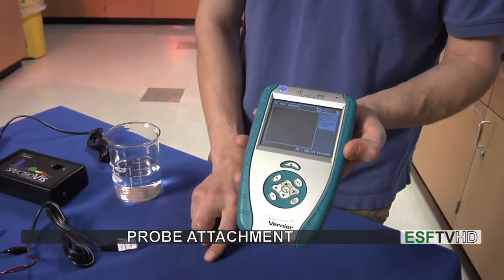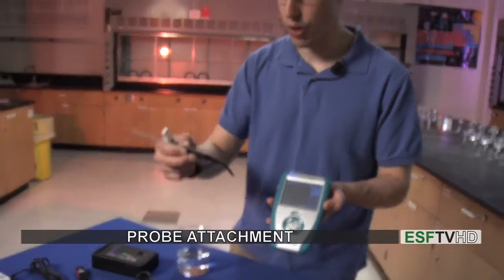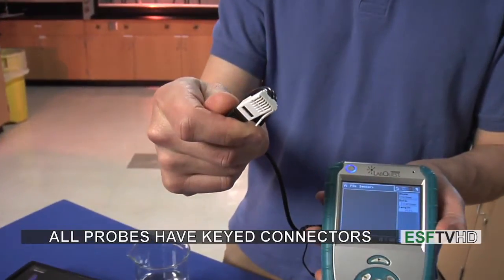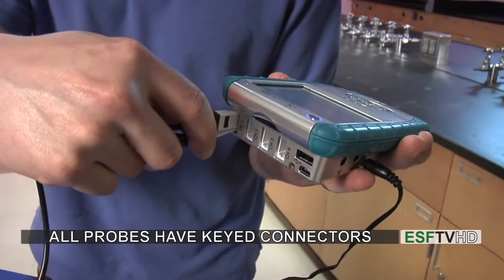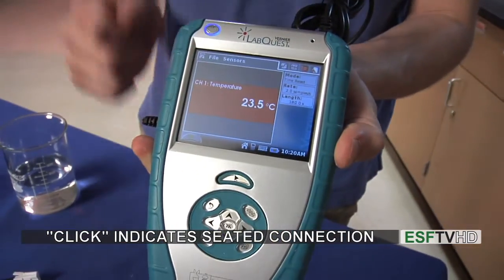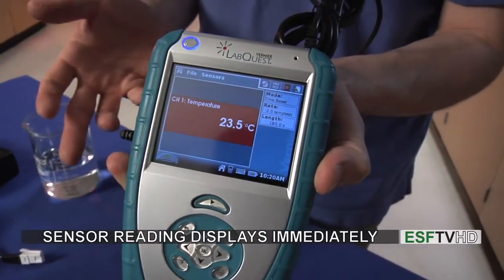The first thing I'm going to do is plug in a probe so we can take a look at how it works. I'm going to select the temperature probe. All the probes have a common plug on them, and that plug will go right into the back of the unit — it only fits in one direction. I'm going to turn the unit over and plug it in; you should hear a little click. Once it gets plugged in we'll see that there's a temperature reading.